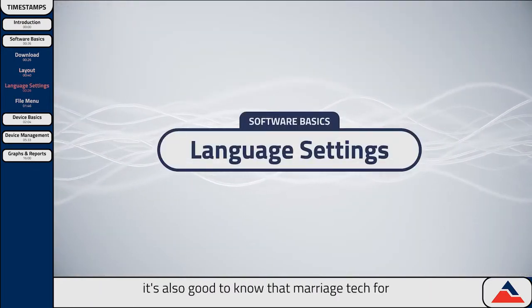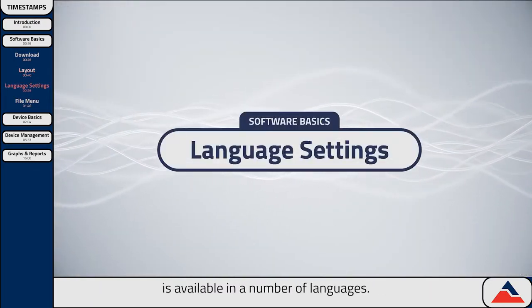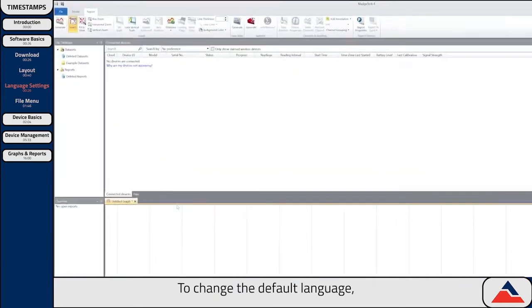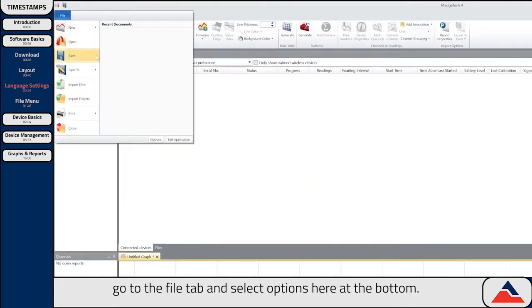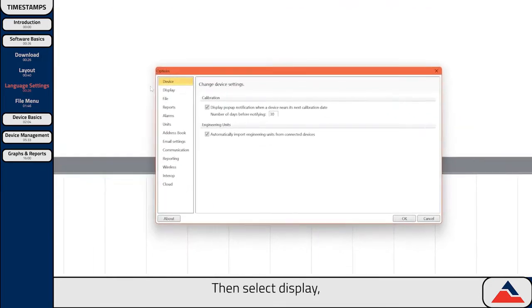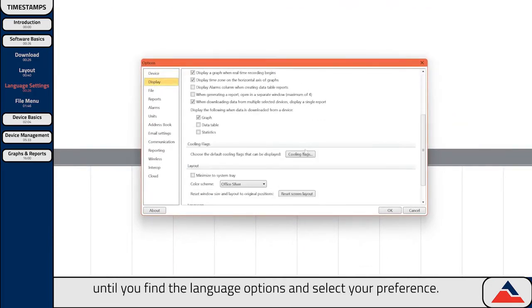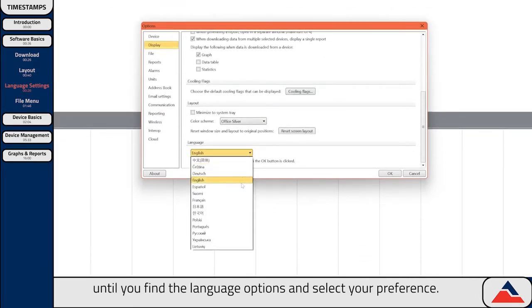Before moving forward, it's also good to know that Magitek 4 is available in a number of languages. To change the default language, go to the file tab and select Options here at the bottom. Then select Display, scroll down until you find the language options and select your preference.